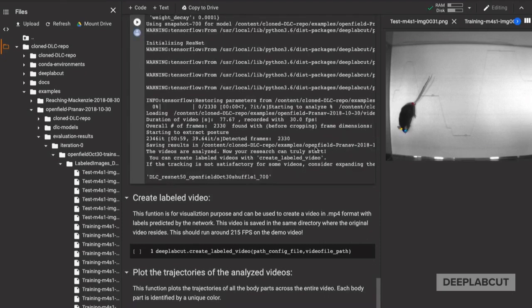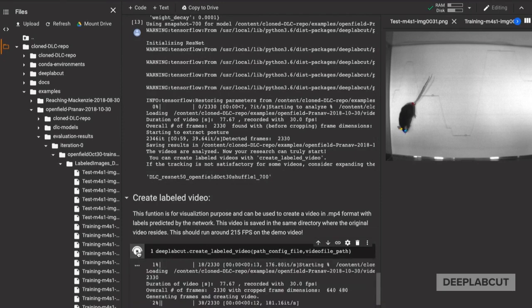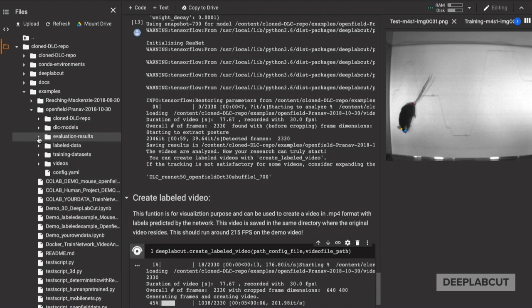Note that you can navigate into the Evaluation Results folder under Iteration 0 and look at the test and training images. This is really a key indicator of whether the network is performing well.